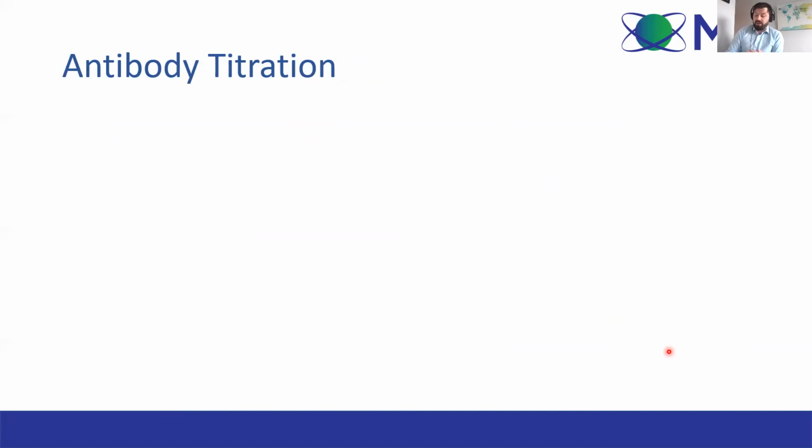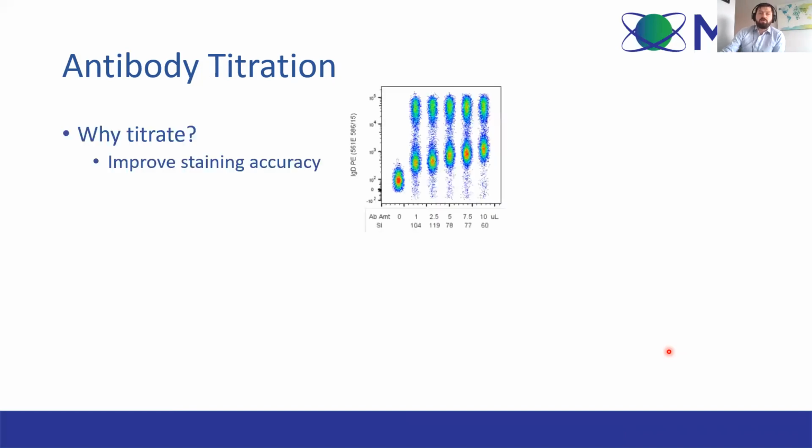It takes time, but it can also save you time. It can save you money, and it can make your data better. So it can save you a bit of heartbreak, can save you having to go back to repeat an experiment or something. So why would we titrate our antibodies?